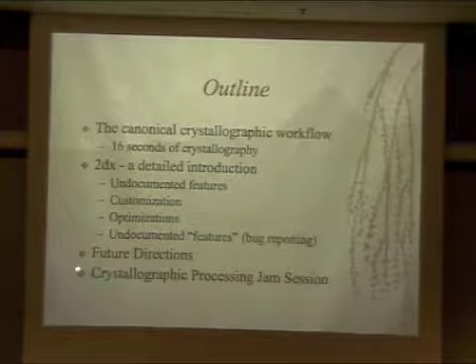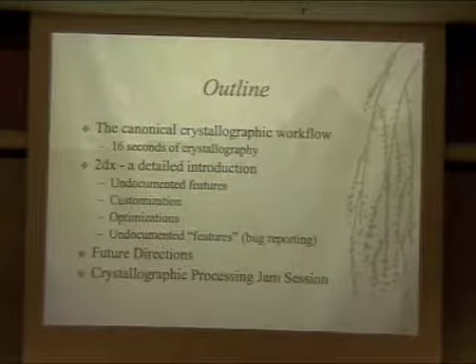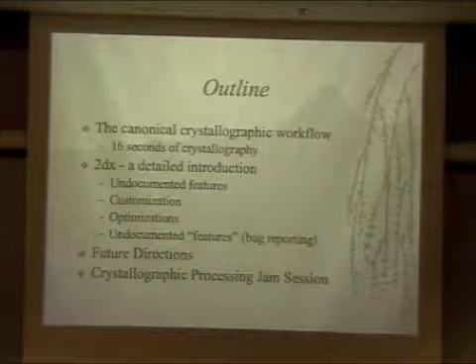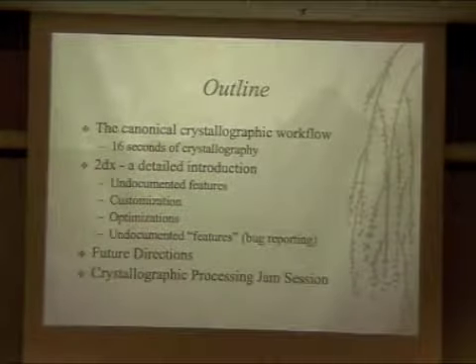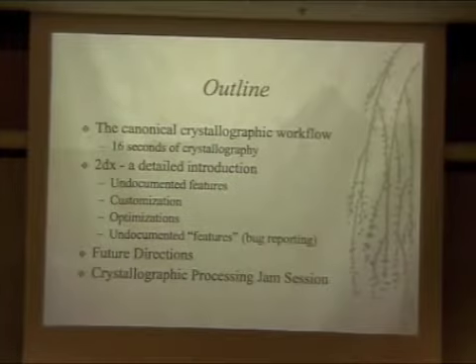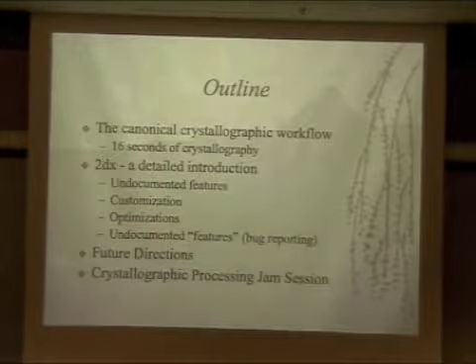And then I'll get into a little bit of philosophy, kind of trying to place 2DX and crystallography, I should say, crystallography as this workflow, in the broader sense of what image processing is. And so I'll make a philosophical argument that we're really just another flavor of single particle, or maybe they're a different flavor of crystallography. And we're all basically doing the same thing, and maybe we'll see some obvious future directions that come out of that, at least as we see them.